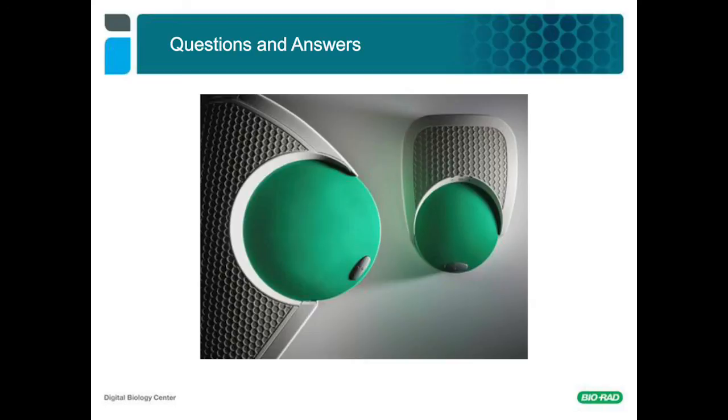It may be that the DNA that you're working with is just so highly fragmented that the targets you're trying to assess linkage between are all busted up. And until you can conclusively show that the sample has enough intact, long molecules to definitively measure linkage, that should be your first step.